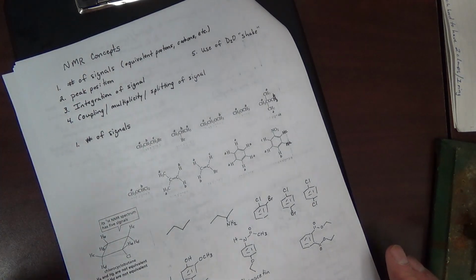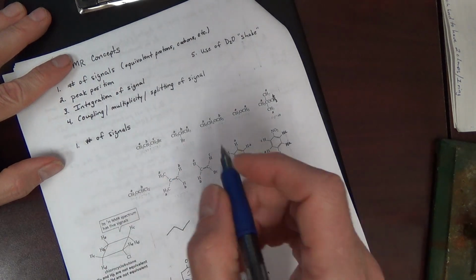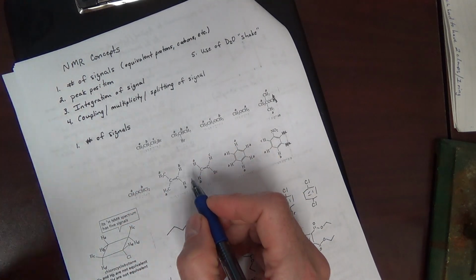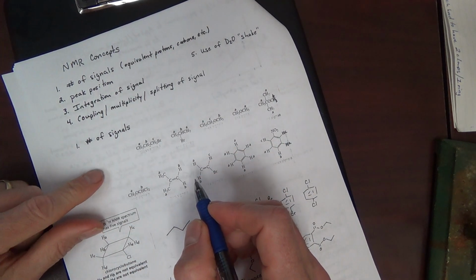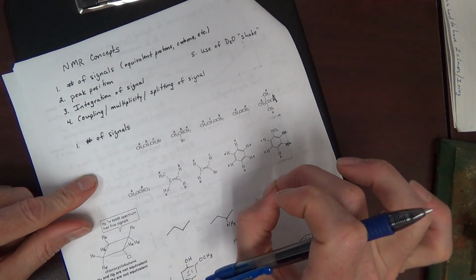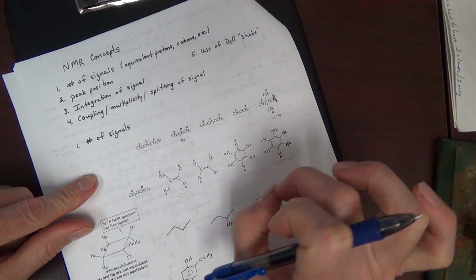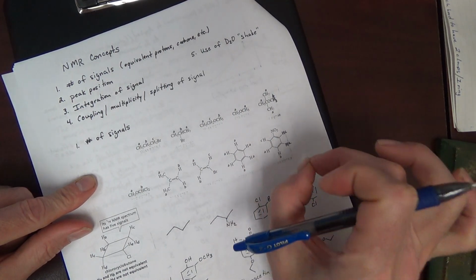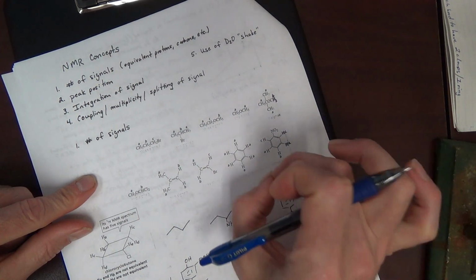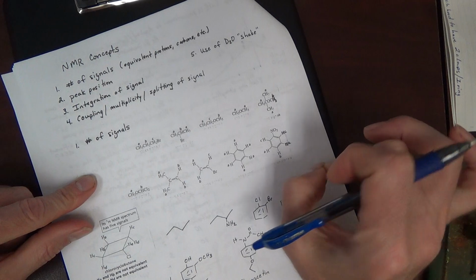First off, we see some examples here, a variety of compounds. Let's just go through these and see how many signals we expect. Ultimately, you should remember that we get different signals for different proton types, because different proton types are going to have different delta E's. The different delta E's come from different proton types having different electron densities nearby.